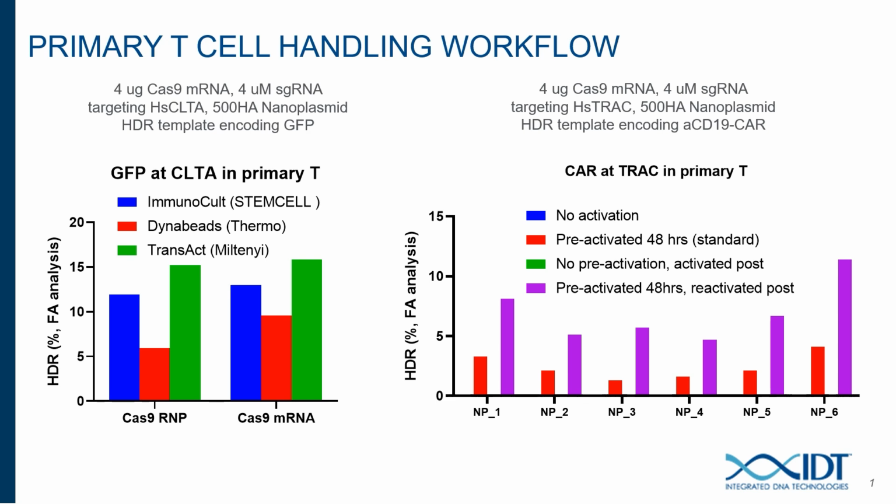The 4 conditions we tested were no activation; pre-activated for 48 hours, which is the manufacturer's directions and what is kind of standard for the field; then no pre-activation, but activated immediately post-transfection; then both pre-activated for 48 hours and reactivated immediately post-transfection.